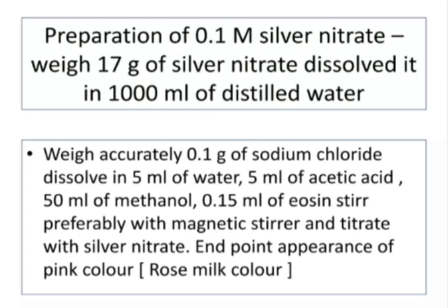If the solution is acidic, calcium carbonate, sodium tetraborate or sodium hydrogen carbonate will affect the neutralization. The neutralization of most of the acid with the ammonia solution, followed by addition of excess ammonium ethanoate, removes the mineral acid. Bromides. Bromides can be determined like chlorides using Mohr's titration method.